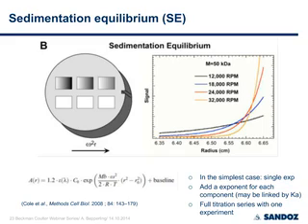And this gives you very robust KDs, and you can use this to screen, for example, binding, especially low binders with a micromolar affinity, which may not act as pharmaceuticals alone, but to check, for example, if domains are expressed correctly or if they can assemble.